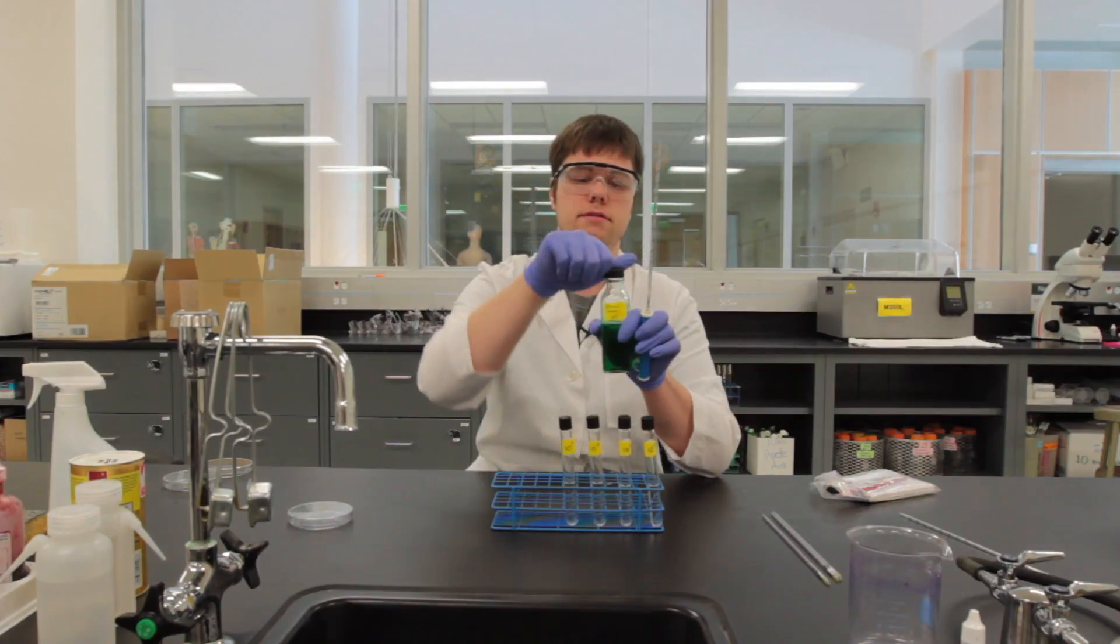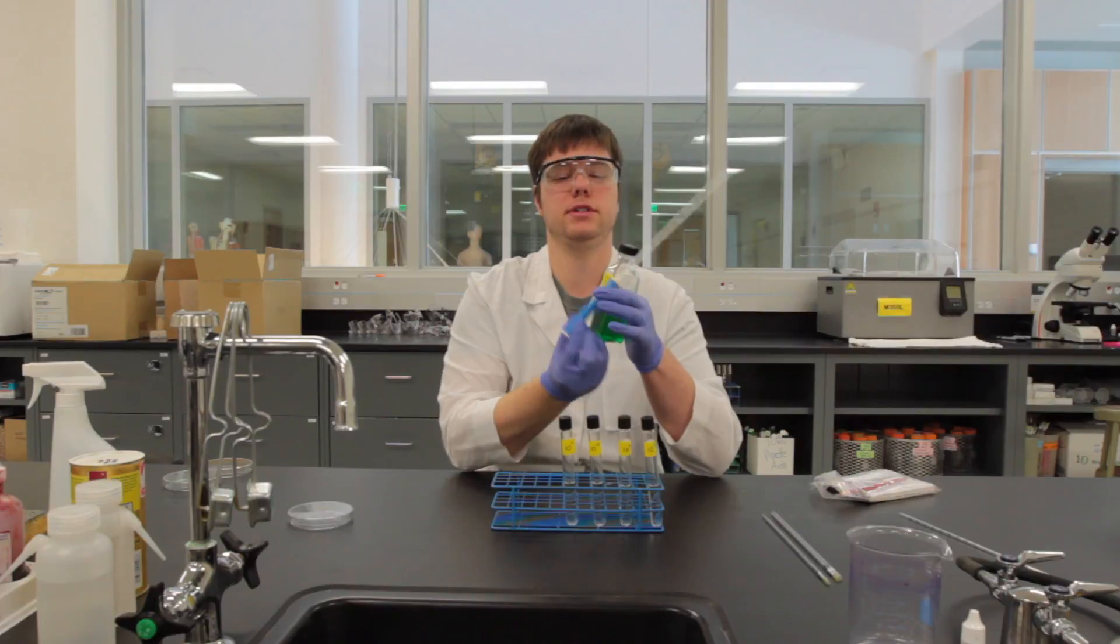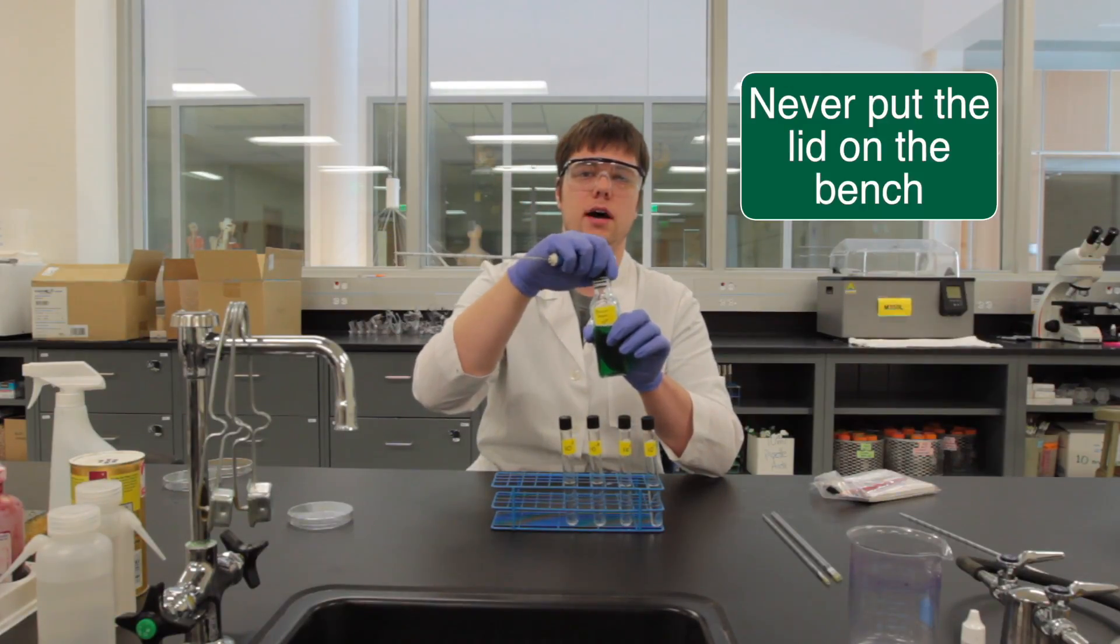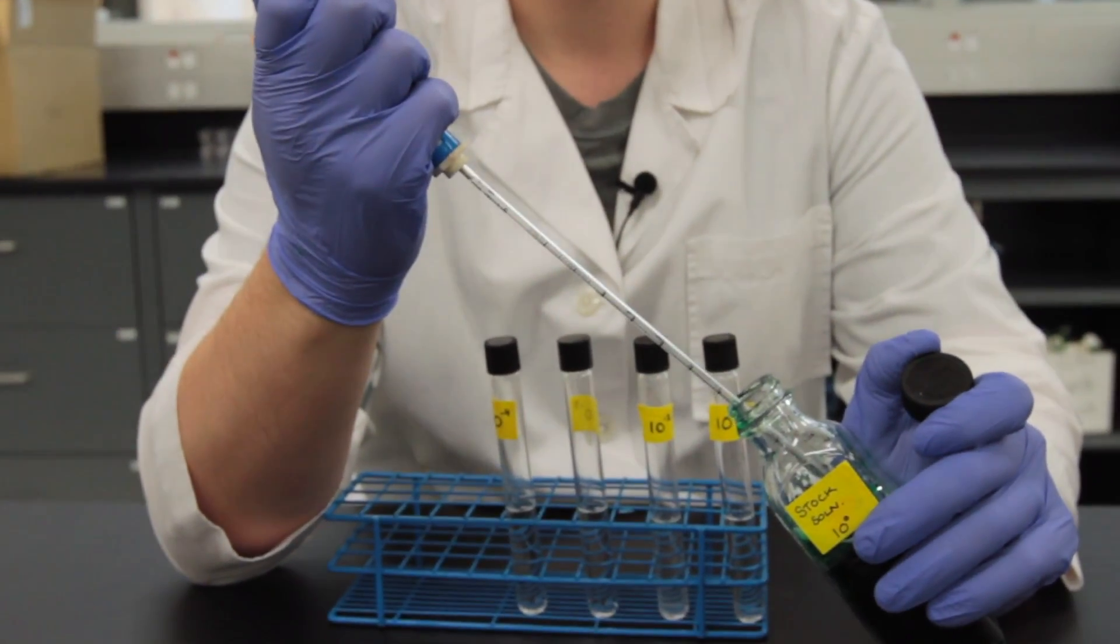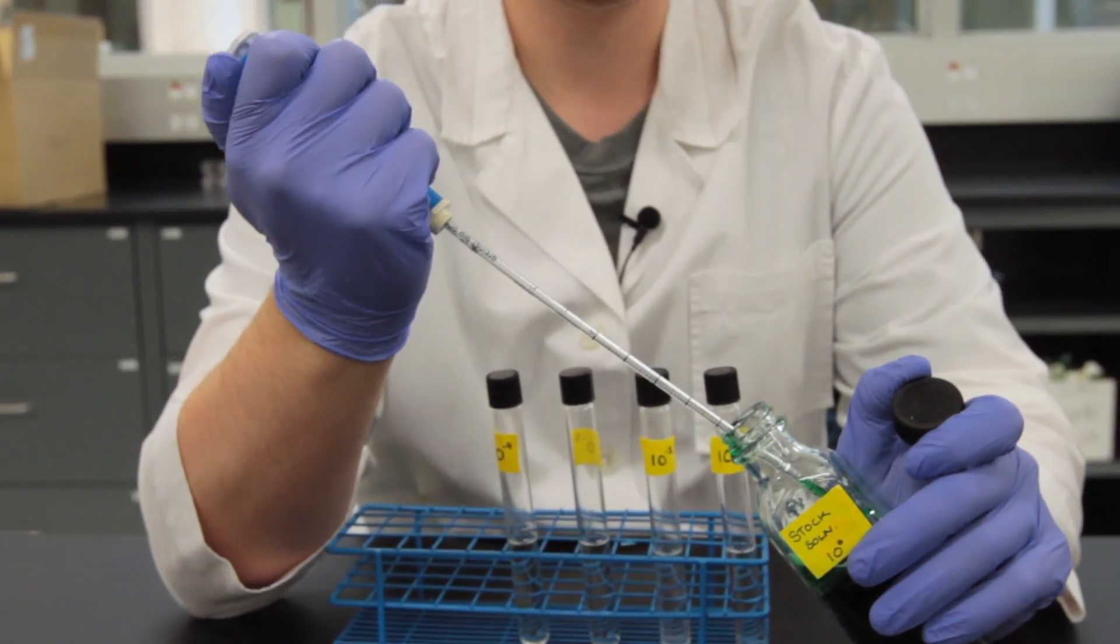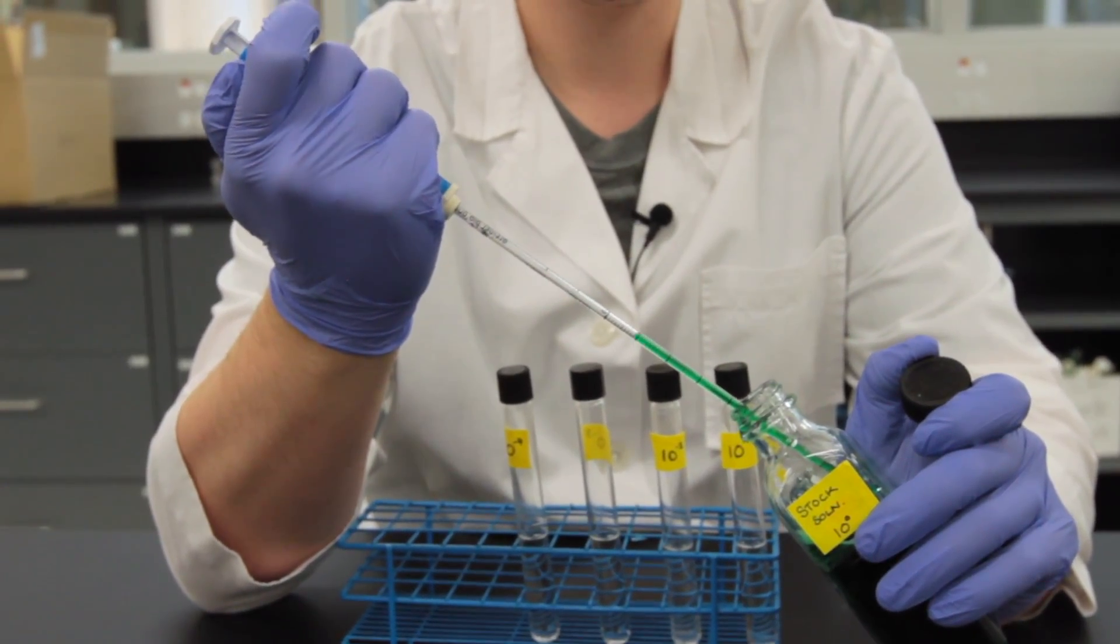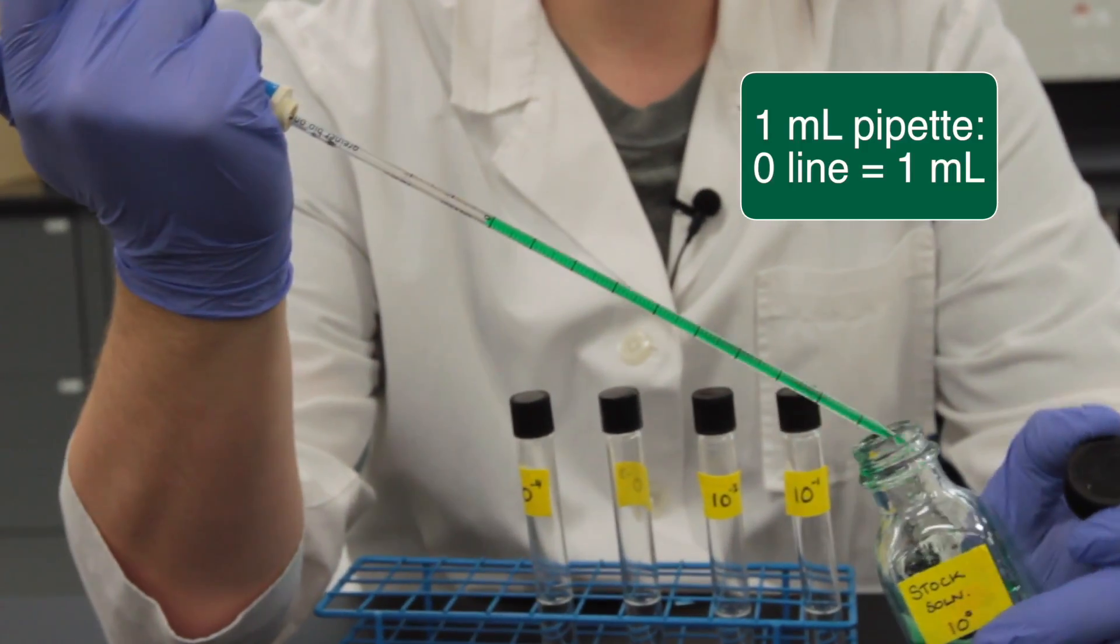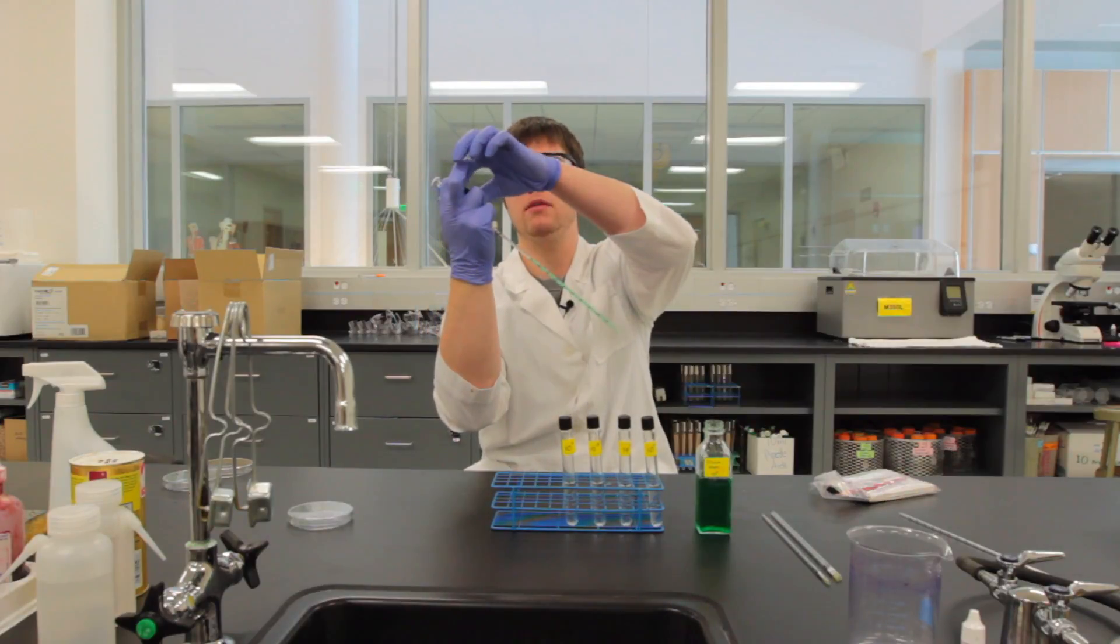We'll take the lid off and remembering our proper aseptic technique, we want to make sure that that lid doesn't touch the bench top. We then take our pipette and dip it into our liquid and we are going to be delivering one mil into our first test tube. So once again we draw up to that zero line, we'll set that stock vial on the bench top.